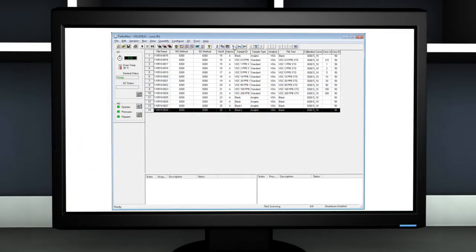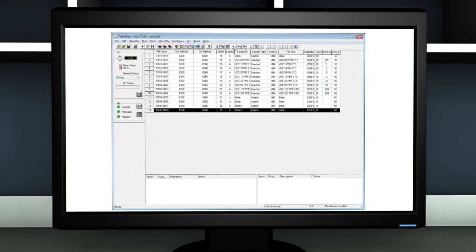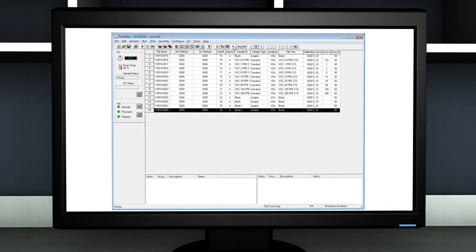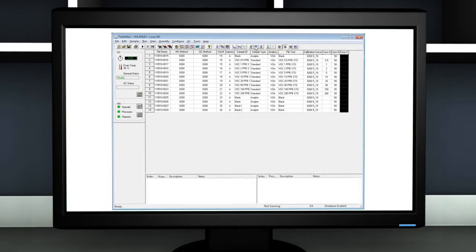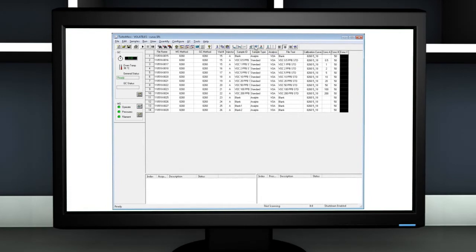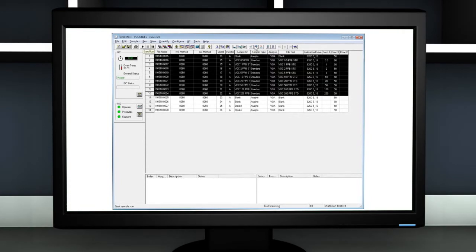Simply create your sample list using the intuitive spreadsheet format interface. Add and delete columns to suit your particular analysis. Highlight the samples you want to analyze and then click the Run button.